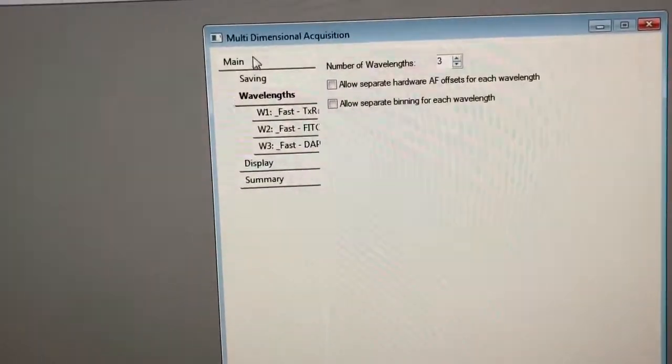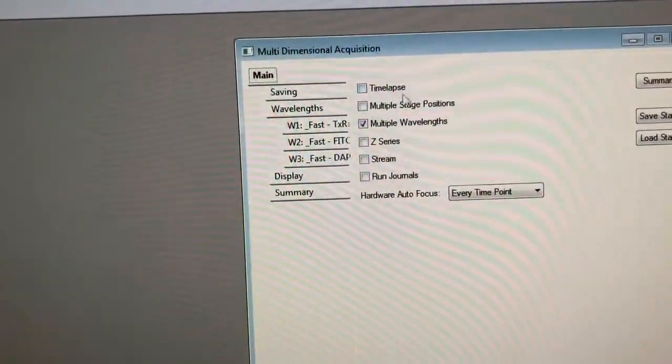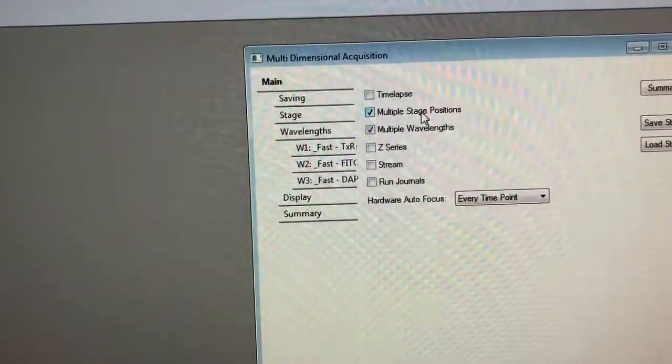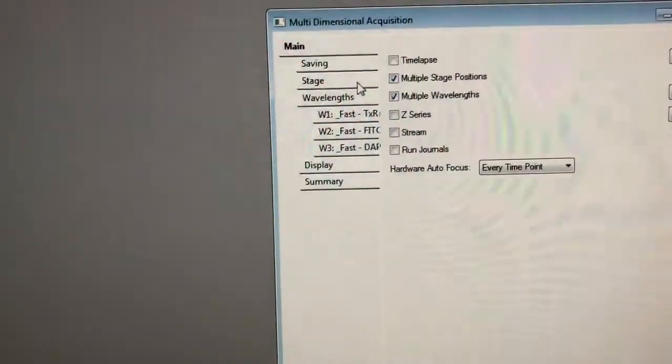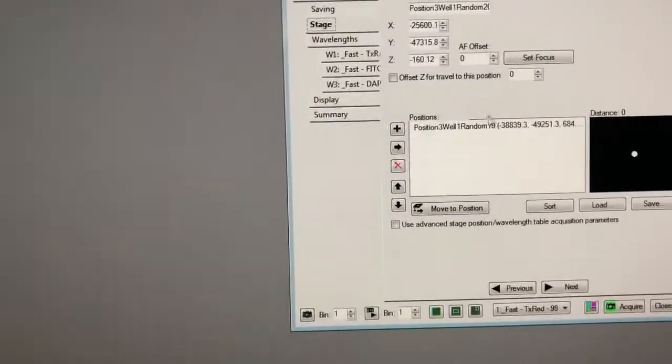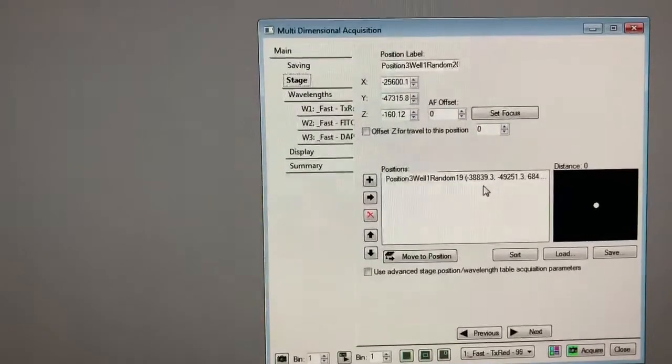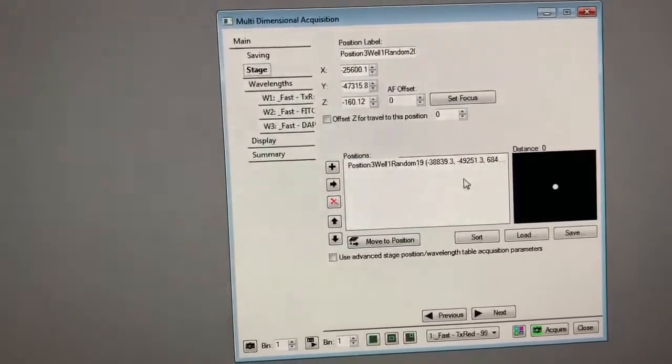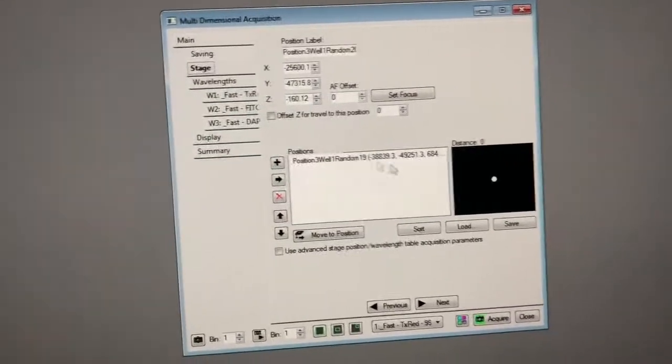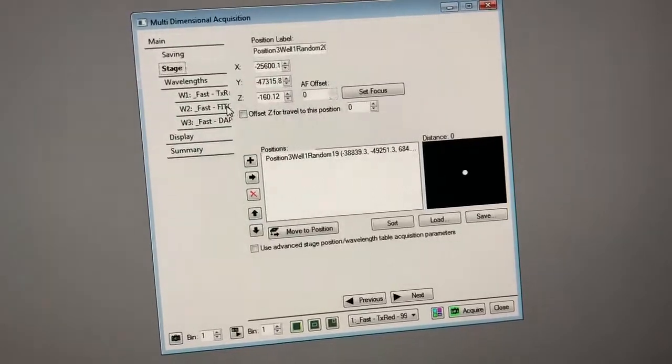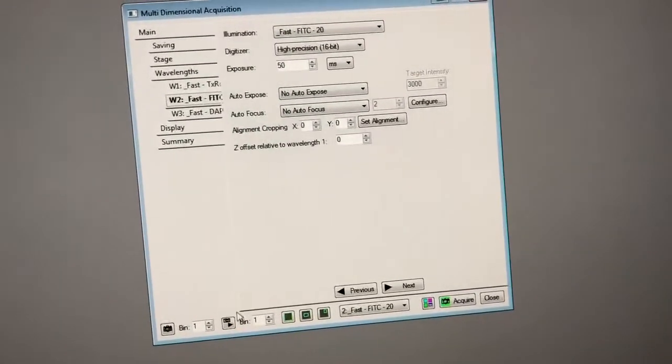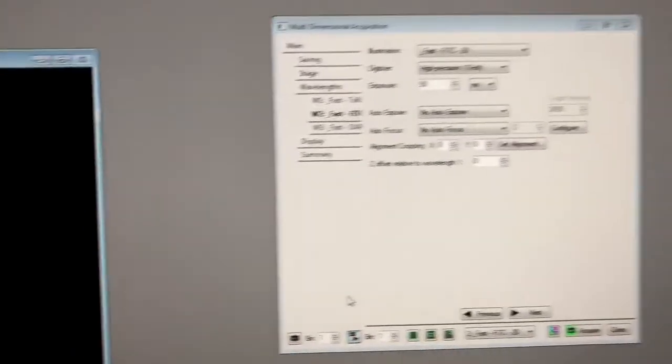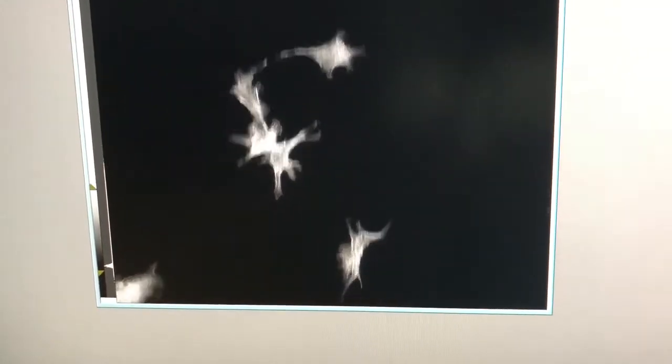So we need to go in metamorph back to main and click on multiple stage positions. This will open another tab here and this tab will allow you to see and mark different positions in the sample. So let's first make sure that we're in focus. So I'm going to go to live and clearly have something there that's good.